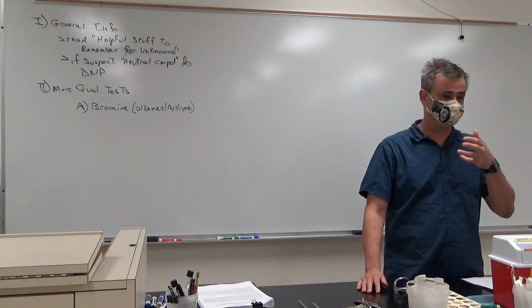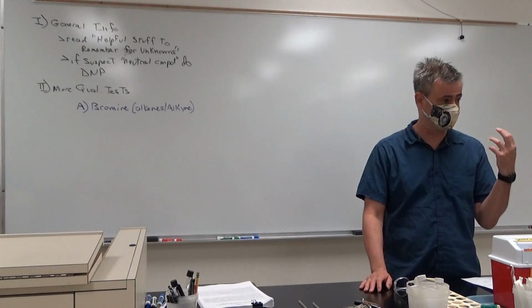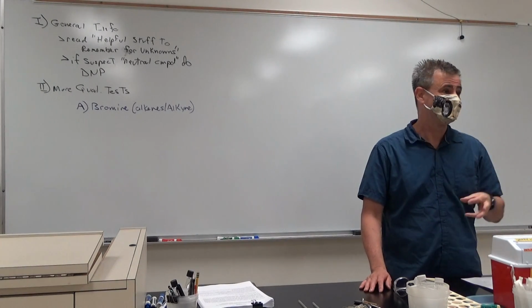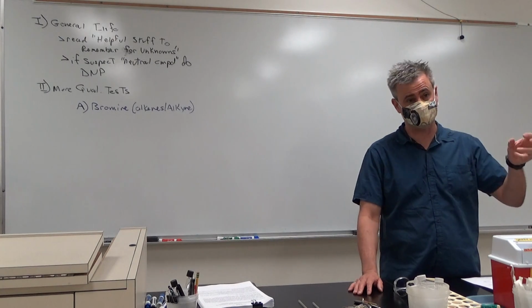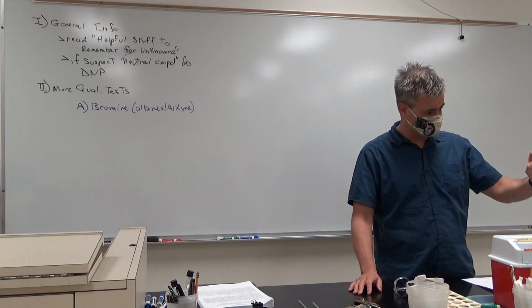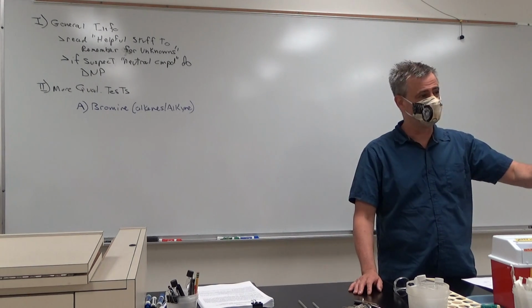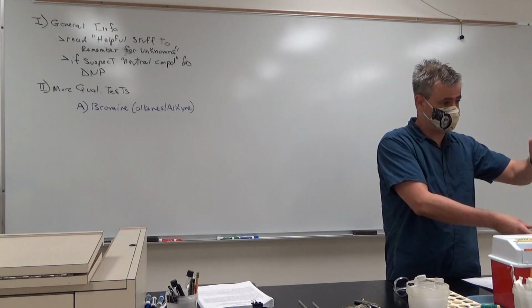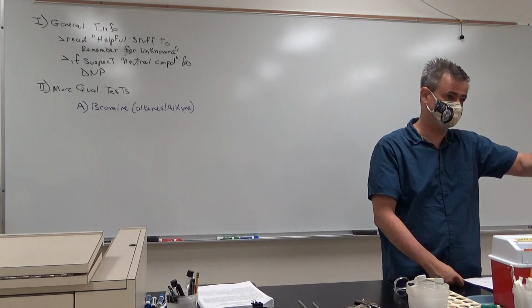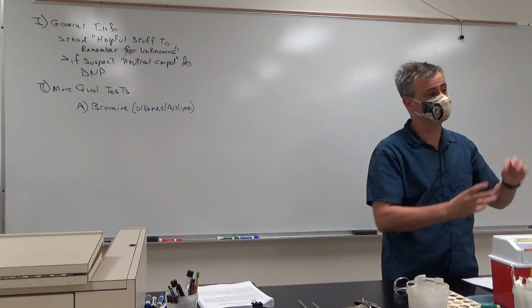With superactivated aromatics, the color goes away, but you also get fuming because you get a different product. You create gaseous HBr, and you can hold a piece of wet pH paper at the mouth of the test tube, and if HBr is being created, it will turn red.